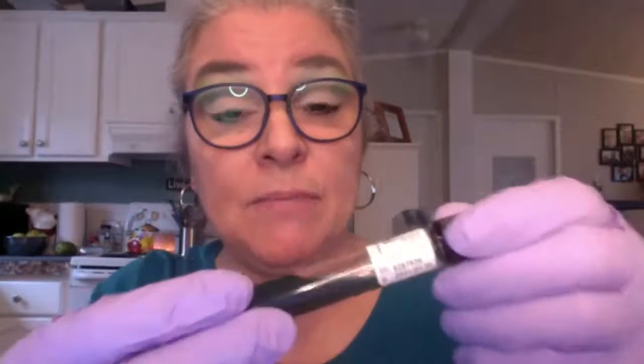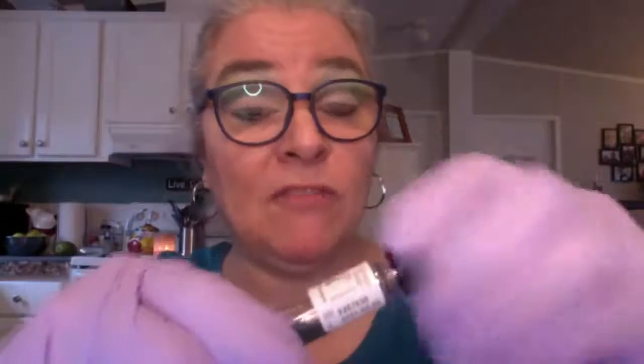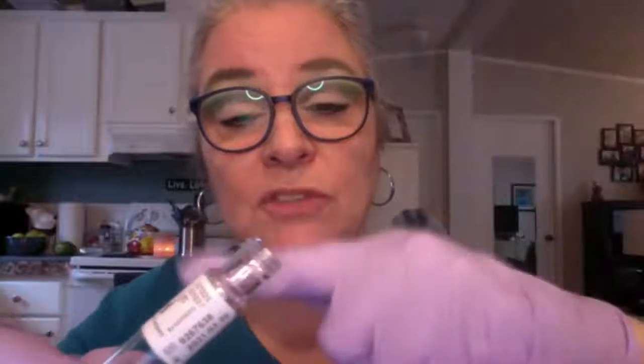If I were going to inoculate this, all I would need to do, using my best aseptic technique, is keep the tube on a slant, remember? When I take the cap off, I want to keep it in my hand. I want to sterilize my inoculating loop. I want to dip it down into my culture aseptically, and then that's going to go into the tube, and I'm just going to smear the agar with it.